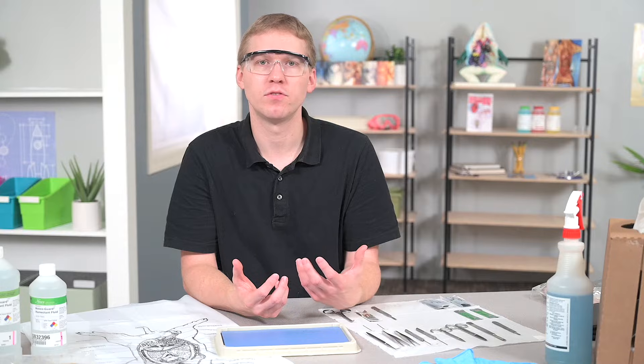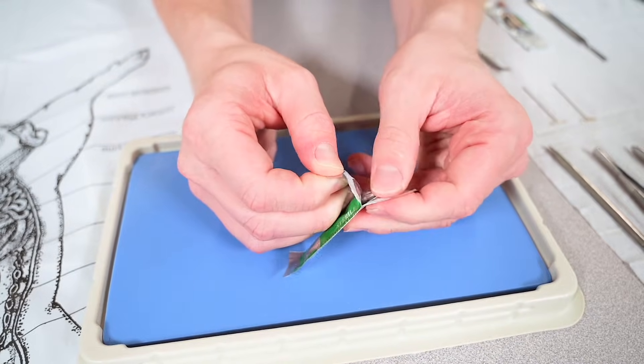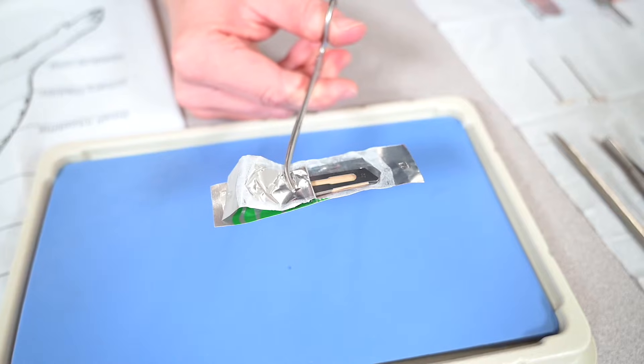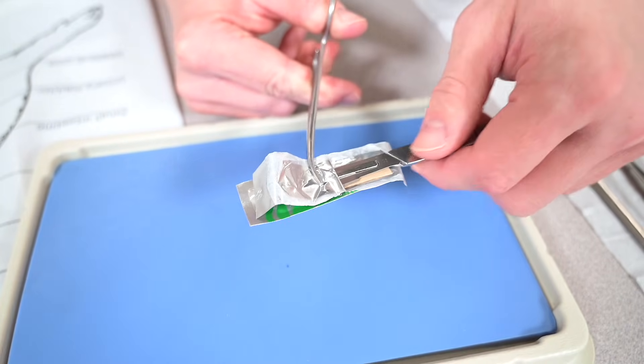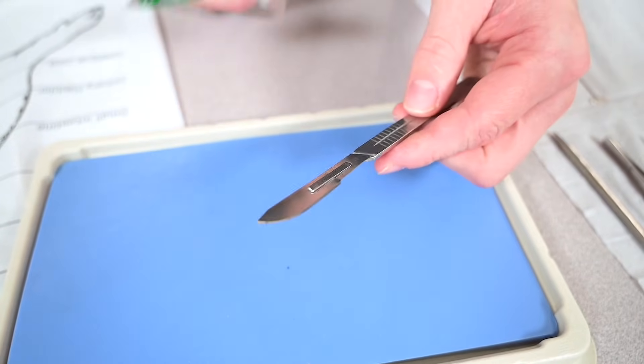To demonstrate, I'm using a scalpel handle number 4 with a number 22 scalpel blade. To add a blade safely, simply open up the package and attach your forceps or pliers to the back of the blade. Then slide the handle into the middle of the blade onto the groove, and it will simply lock into place.